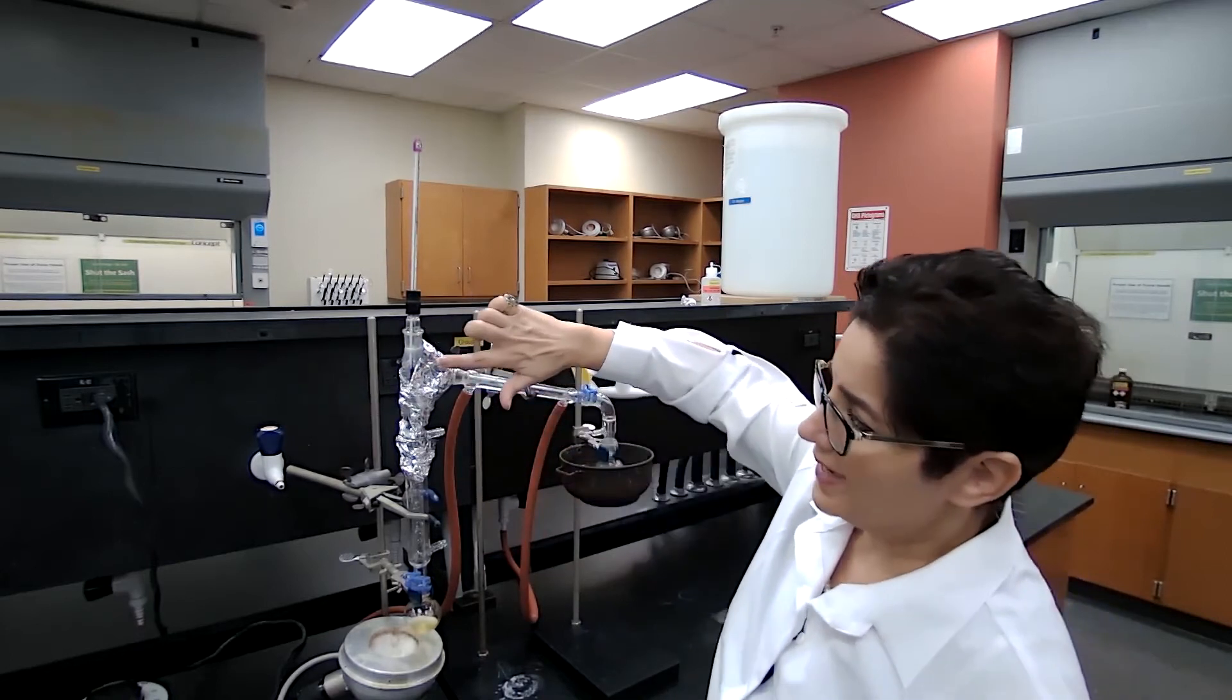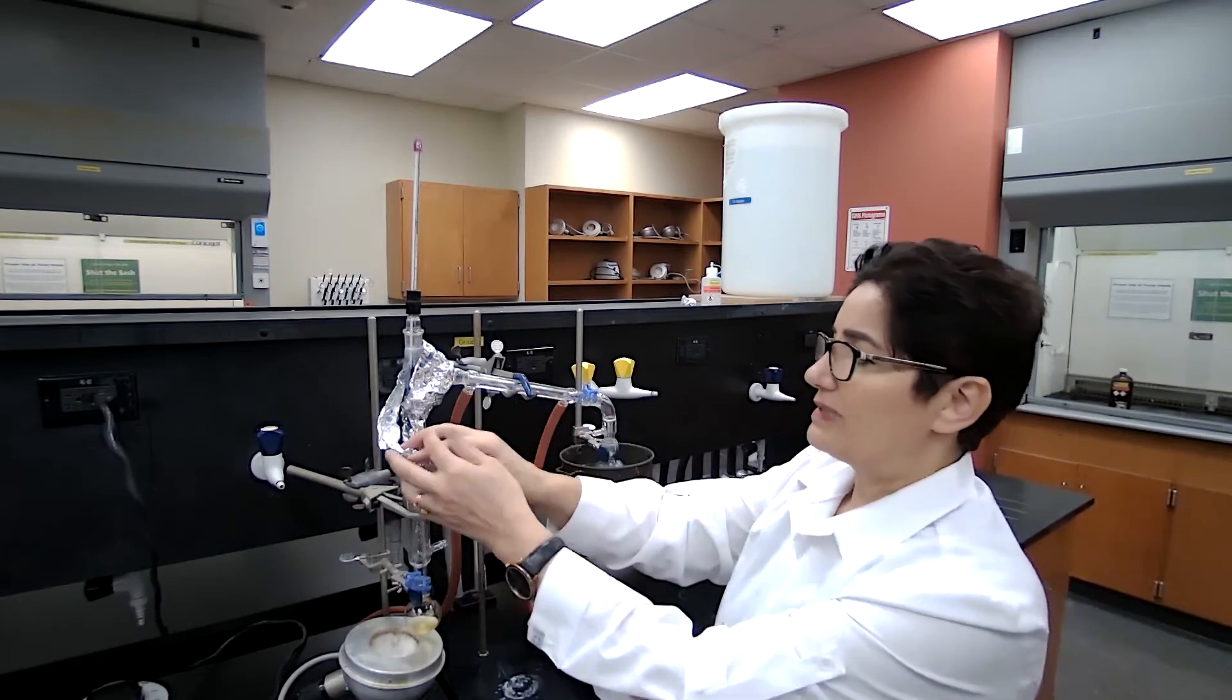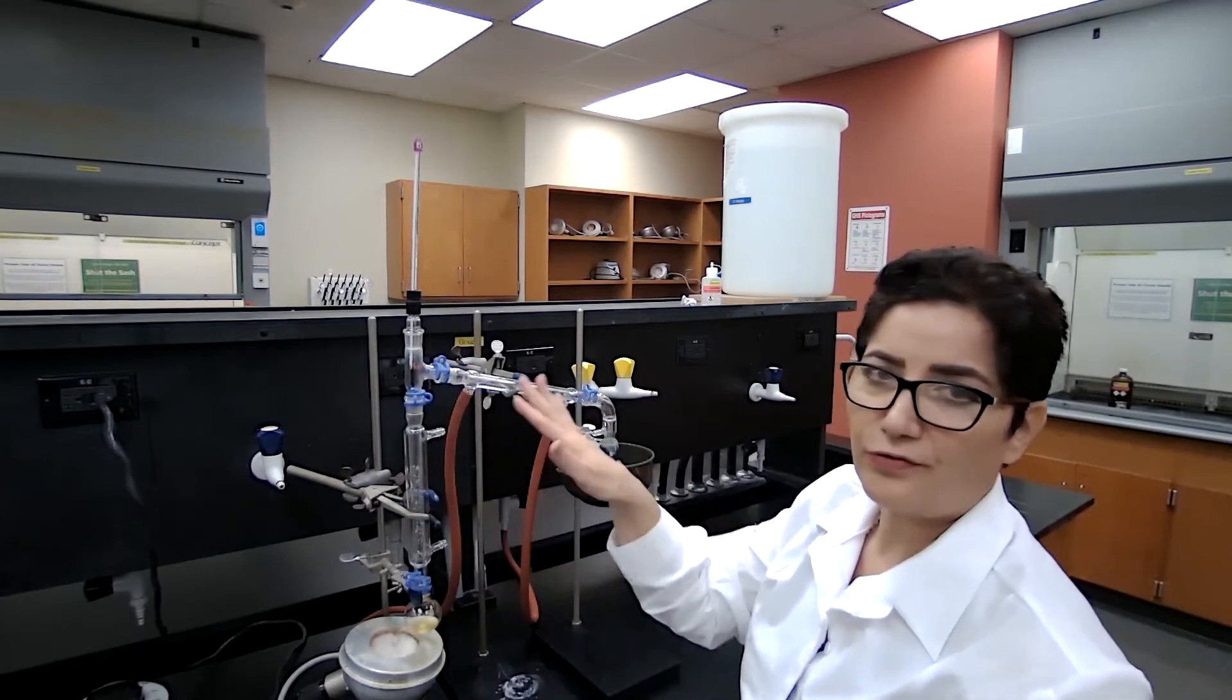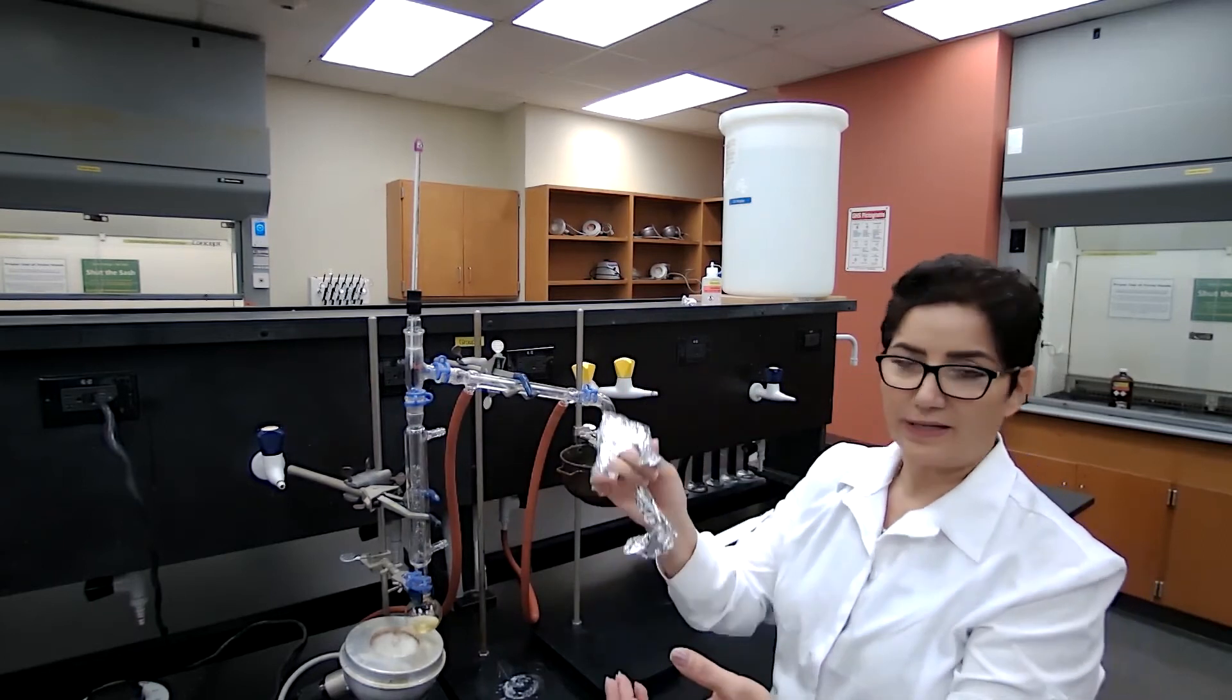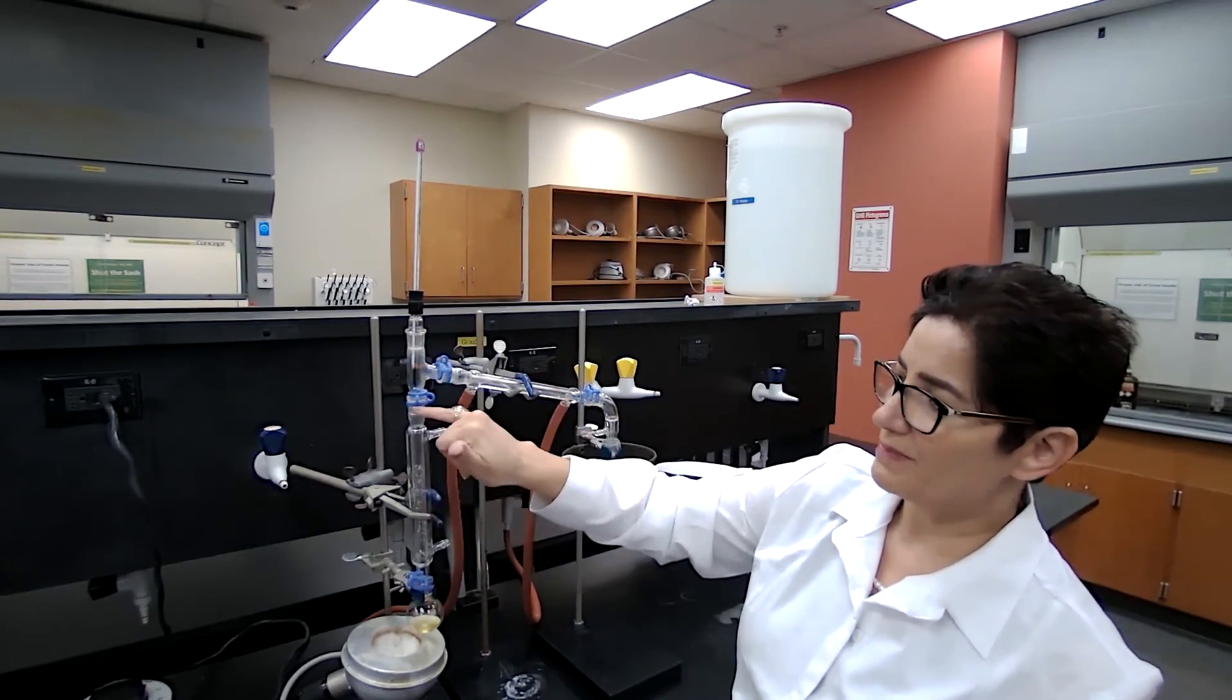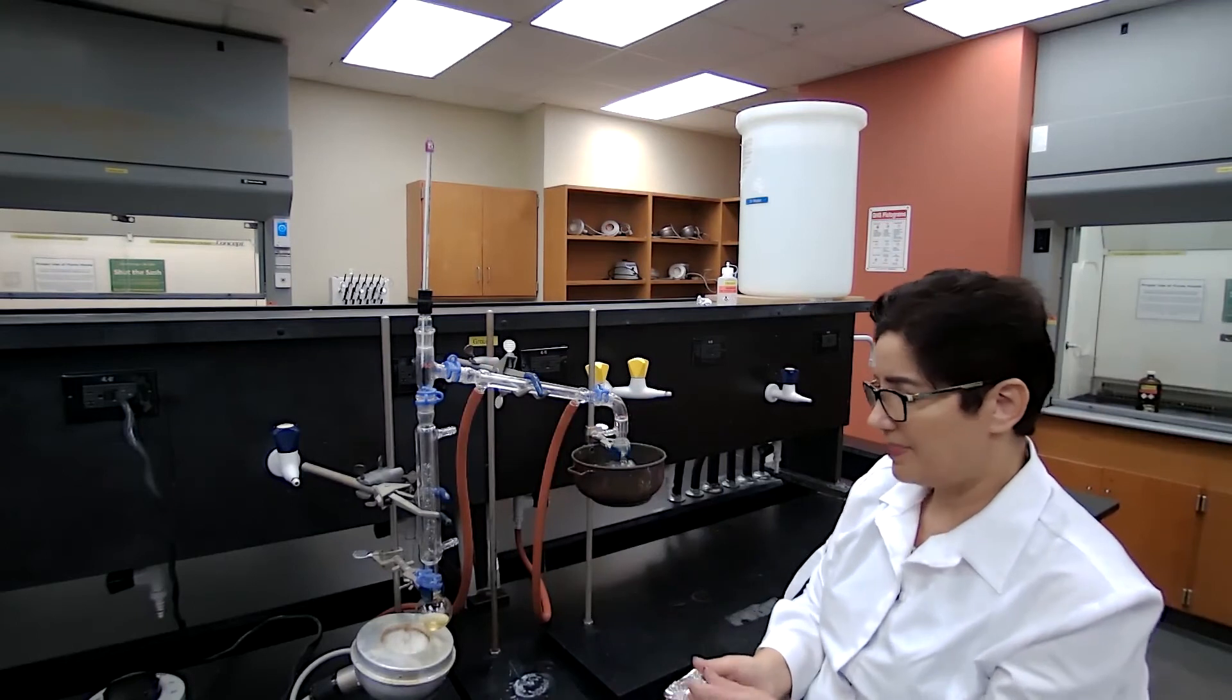I also want to add a point about this aluminum foil wrapping around the distillation head. Whenever you're doing fractional distillation, if it takes too long for your sample to make it to the condenser or receiving flask, you can use aluminum foil to wrap the distillation head so the vapor that makes it all the way up would be directed into the condenser.